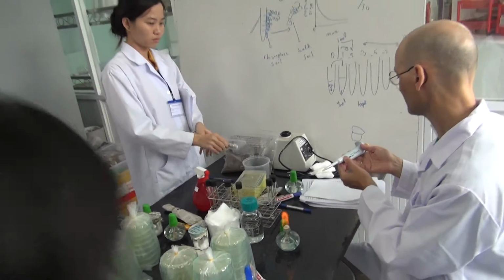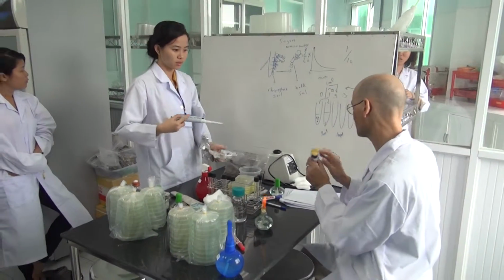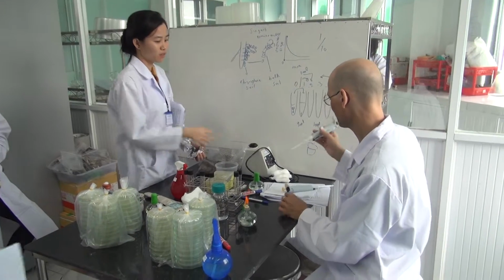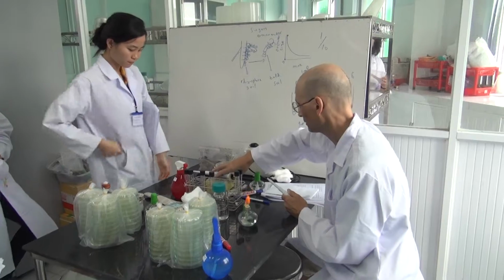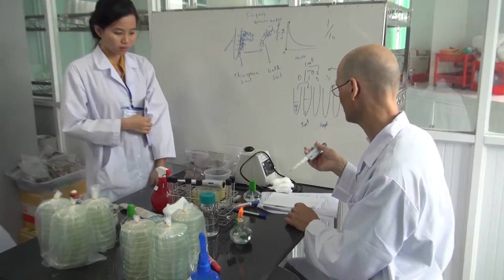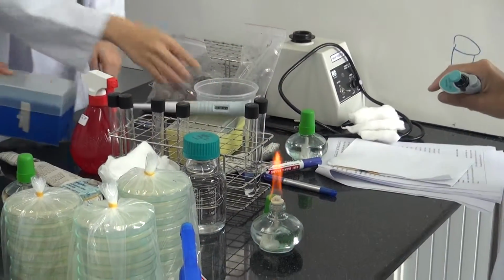Oh, you sterilize that. Is it okay? Yeah, but we never sterilize them, it's just here. Is it affecting the quality of the iron? Yeah, it's good. But need the big ones. Yes.